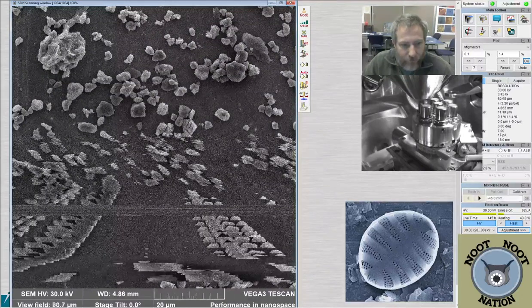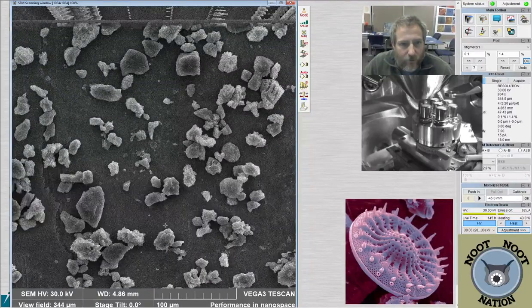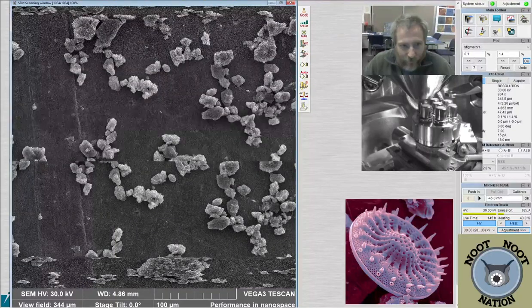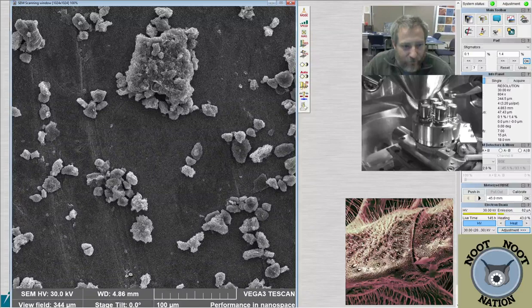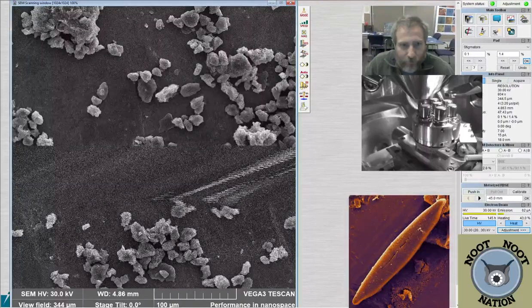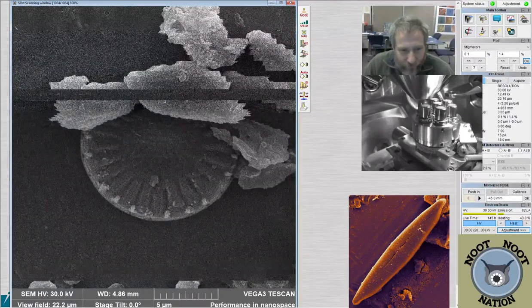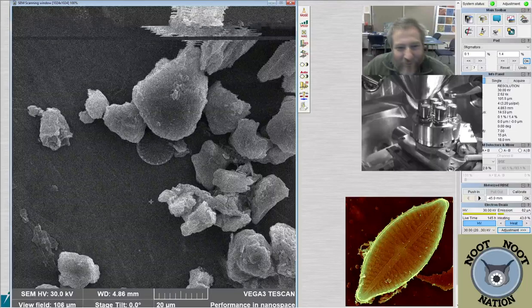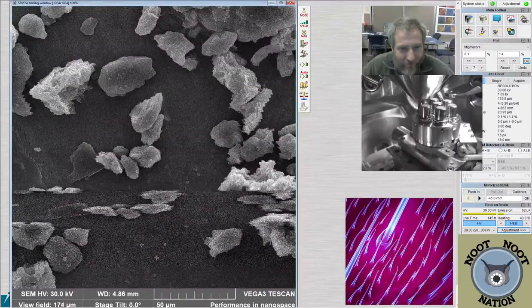Maybe this is one we could use. Oh, that one's got junk on it. There's two of them. It's always a constant struggle in the SEM, fighting with clay and silt-sized particles that get stuck on the diatoms. Like I said, you just kind of get used to it, but if I'm taking pictures for a poster, I don't want to have giant lines going across it. That's meneghiniana again from the outside. It's just got two giant boulders sitting on top of it. Silt-sized boulders. So it would have been good if I could get the silt off of it.